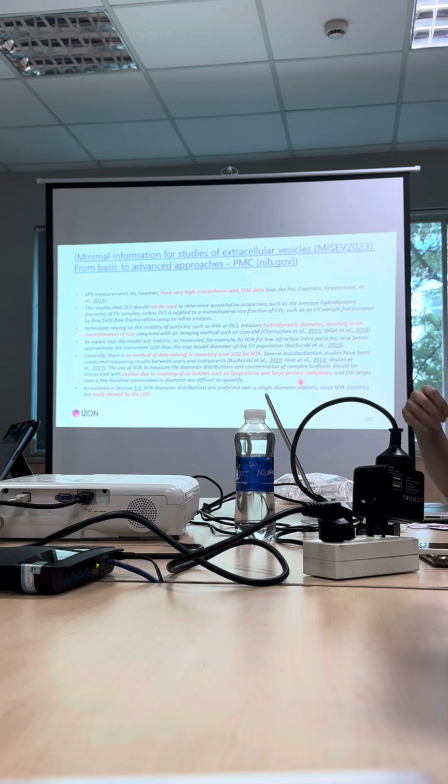It's also good for your downstream work, not only in vitro study. For downstream in vivo study, you also need pure EV particles. Otherwise, if for example you provide CCM with other impurities, it will harm the animals. And also, you see that the NTA data is easily skewed.